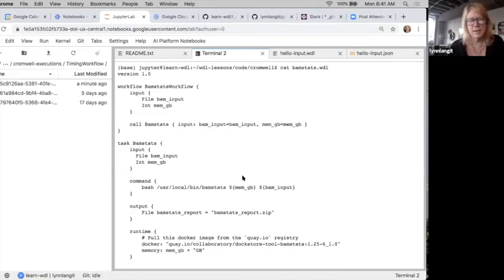So if you're using haplotype caller and like every part of it, great, go ahead, go to town on that. But to me, it just was too many parts and pieces, and I needed to start with tasks that were simpler to understand WDL and to understand inputs and to understand validation and to understand scattering. And so I've got this BAM stats, which basically just is a single task, but it's a bioinformatics task. I've also done ones with BLAST, and I have those examples as well.